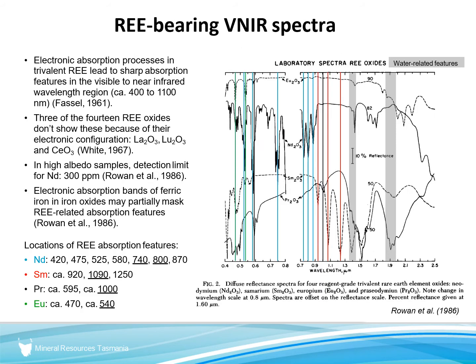Now, there's one other type of absorption, and these are rare earth elements. The atoms actually have their own spectral fingerprint. So we're directly seeing here rare earth elements, be they in allanite or whatever. So if there's plenty of that around, you can sometimes see these very sharp absorptions down near the visible area of rare earth elements. It's a specialized area.